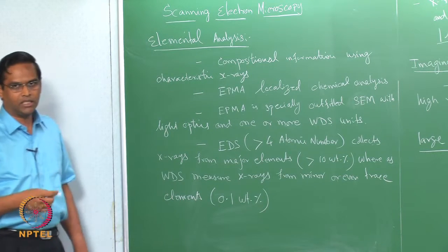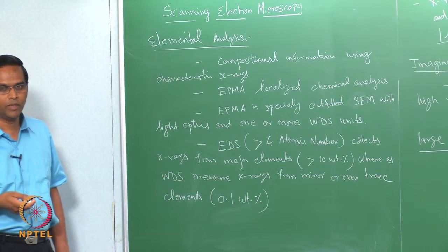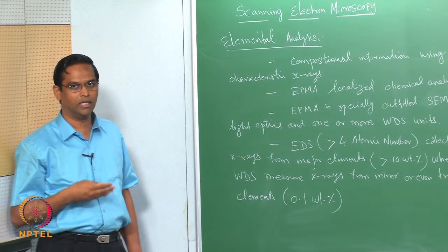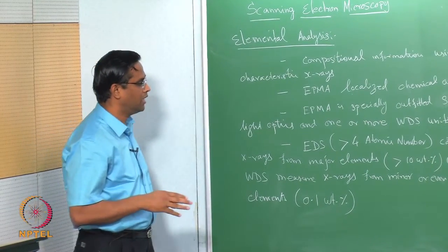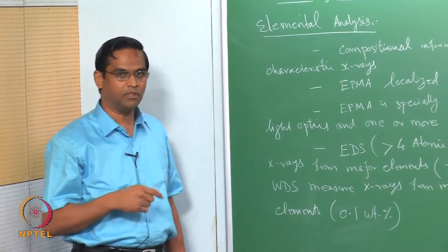We will see all these variants of the spectrometers, which use the characteristic X-rays that come out of the sample to do the chemical analysis. We will look at them in a separate lecture series, but these are one of the primary attachments to the SEMs.